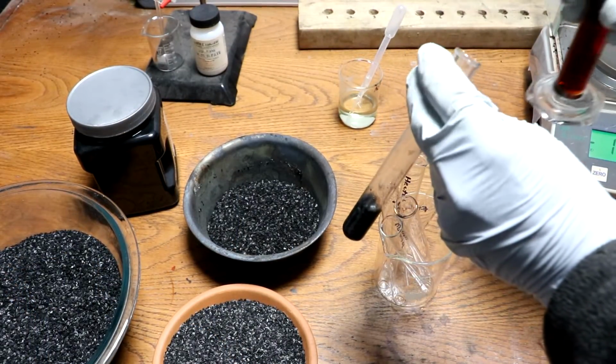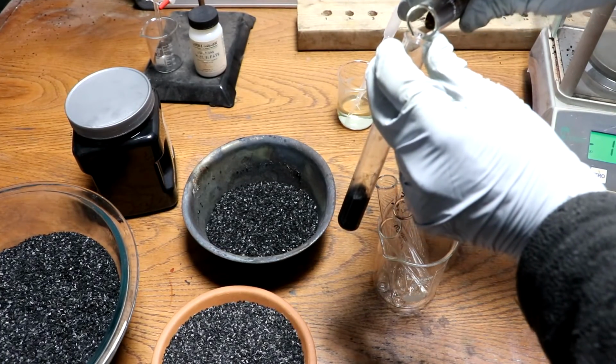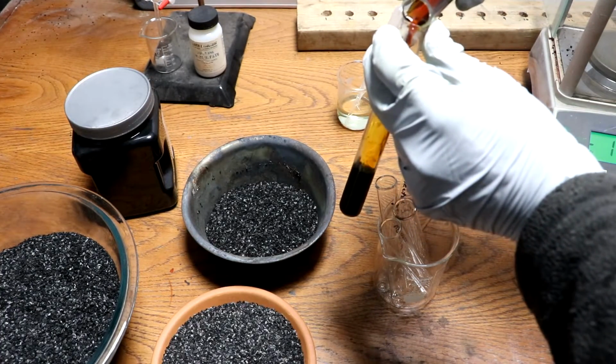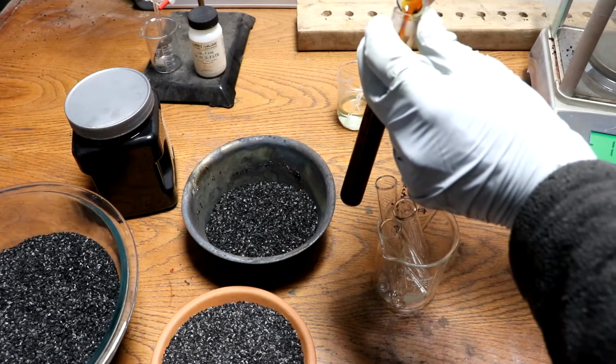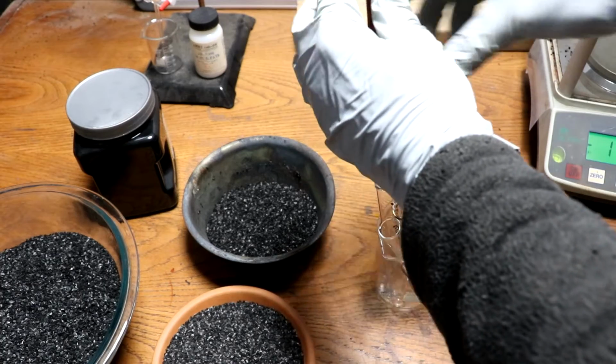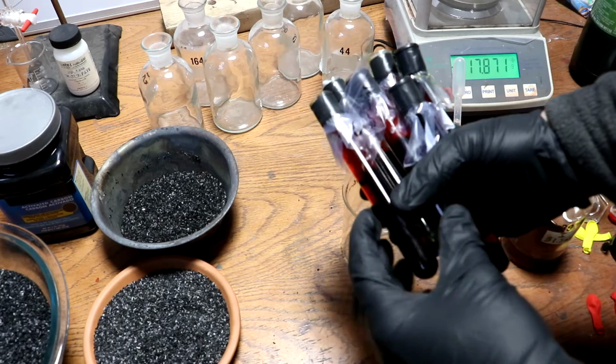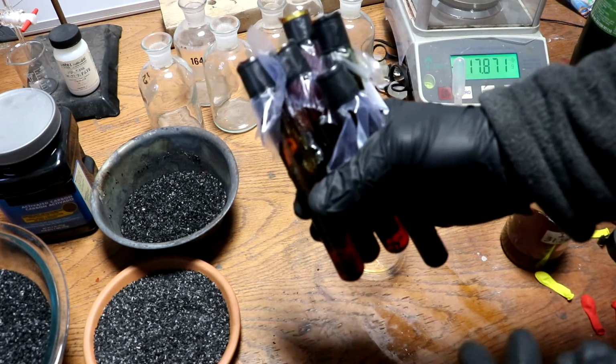Now that I have the charcoal acidified, I'm going to add 25 milliliters of the iodine solution. This is iodine and alcohol, by the way. Hopefully this fits. Oh, perfect. Okay. I'm going to have to find a cap for this. So here's all my samples. I'll just kind of give these a shake every now and then.